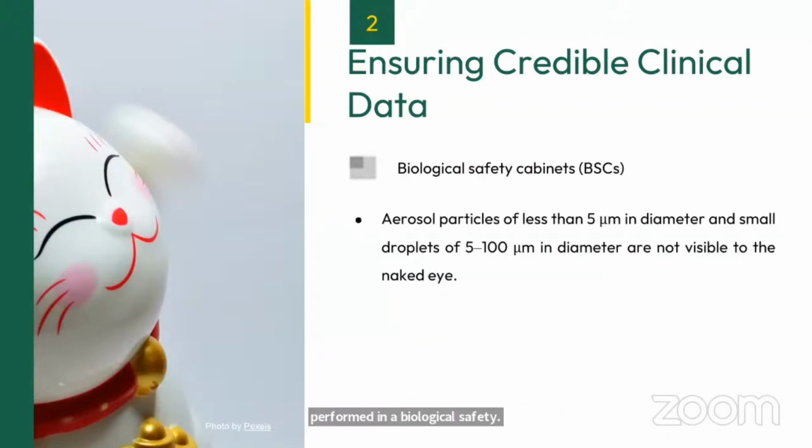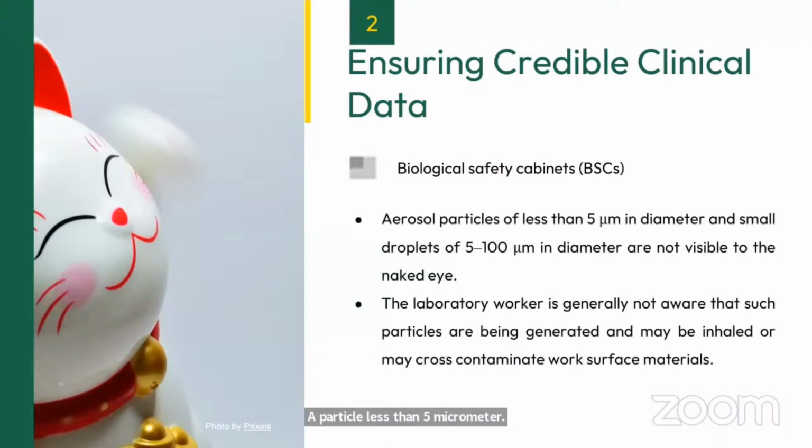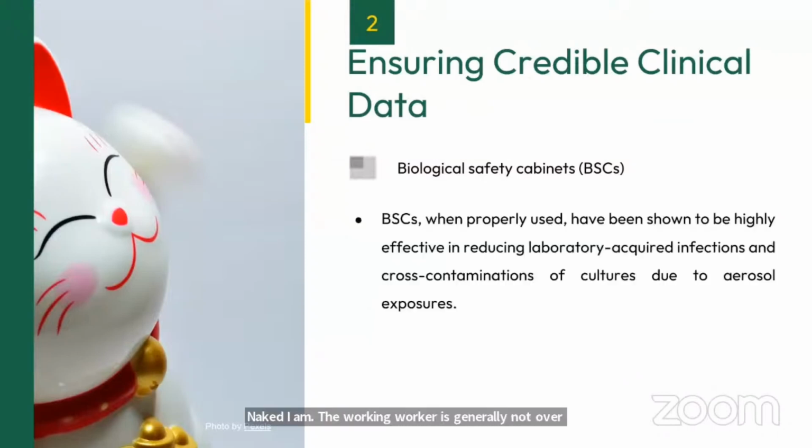Aerosol particles are less than 5 micrometers, not visible to the naked eye, and the laboratory worker is generally not aware of such particles being generated and may accidentally be exposed. Biosafety cabinets, when properly used, have been shown to be highly effective in reducing laboratory-acquired infection and should be used wherever cross contamination is suspected.